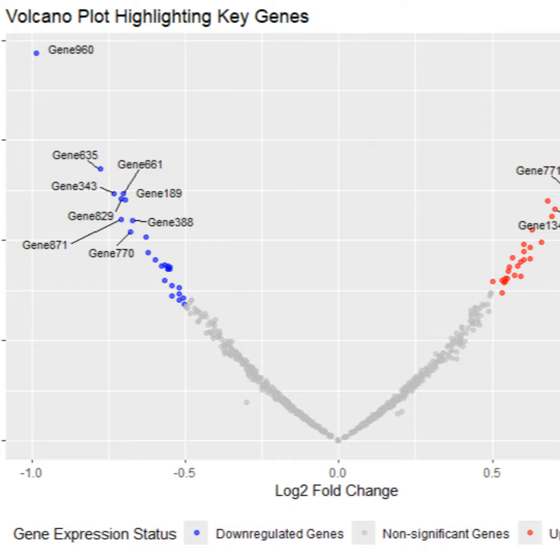Let's say a drug significantly downregulates a bunch of genes. Pathway analysis might reveal that those genes are all involved in inflammation. Boom. We might have a new anti-inflammatory drug on our hands. Wow, it's like having a detective tool that helps us understand the motives of those genes and how they're working together, either for good or for evil.